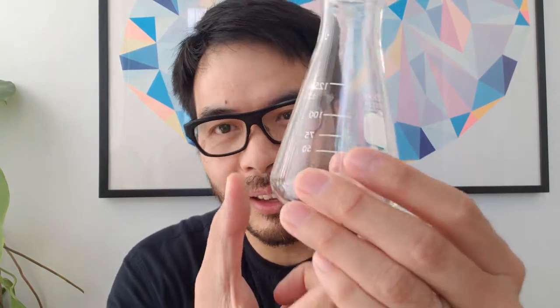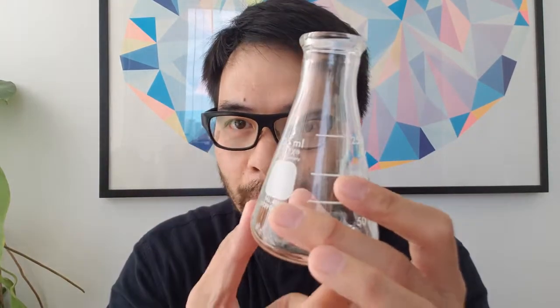Consider the example of an Erlenmeyer flask. What is this used for? Let's consider its form — it's got a very narrow top and a very wide base, it's made of glass, and it has some markings, but not very detailed. Claim: an Erlenmeyer flask is used for mixing materials. Evidence: it's got a very wide base, a very narrow opening, and it's made of glass. Reasoning: the narrow opening on a wide base prevents splashing when mixing — nothing can splash out. And it's glass so it can't react with whatever is being mixed inside. Thus, the Erlenmeyer flask is perfect for mixing solutions.